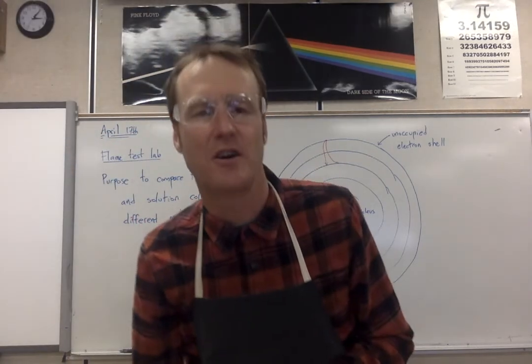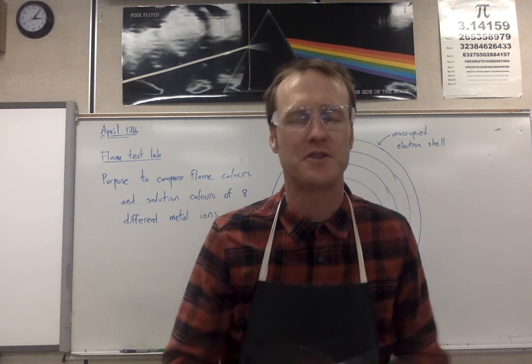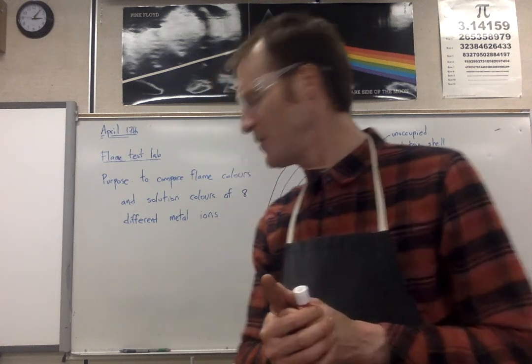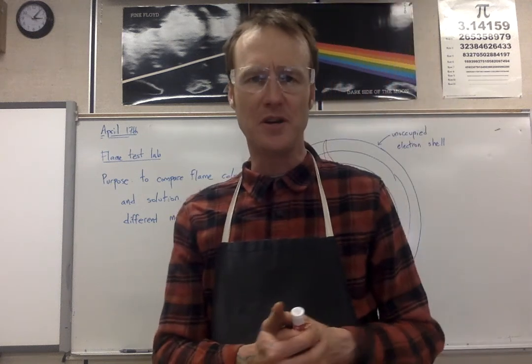Yeah, the 2nd page starts with the color of the flame, if any, with just the glass rod and so forth. So yeah, it is page 2. You'll be filling in the results. I'm going to get the Bunsen burner going, and we'll get this started, and I'm going to explain what I'll be doing for each of these samples.